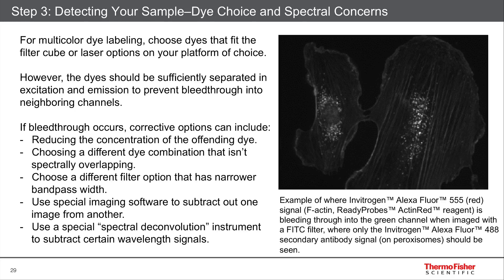So what do you do about this? First off, you can reduce the dye concentration of the offending dye. In this image, I would want to reduce the concentration of the Alexa Fluor 555 such that it's not as bright and thus doesn't bleed through as much. Another choice is to use a different dye combination — instead of Alexa Fluor 555, choose a dye that's farther away from the green, such as Alexa Fluor 594, which is in the Texas Red wavelength, or even a far-red dye like Cy5.